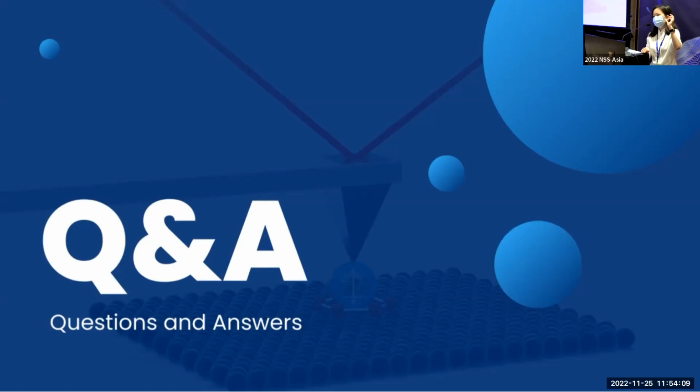So this is also the reason that the KPFM resolution is not as good as the STM, but for user convenience, the KPFM is very convenient. It's easily accessible. Yeah, I agree. Thank you very much.